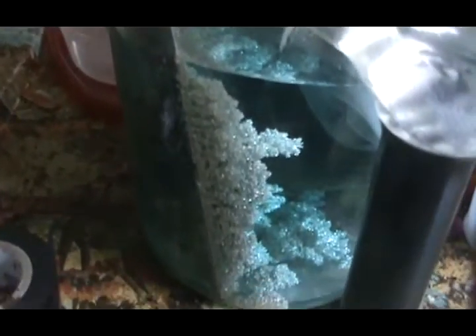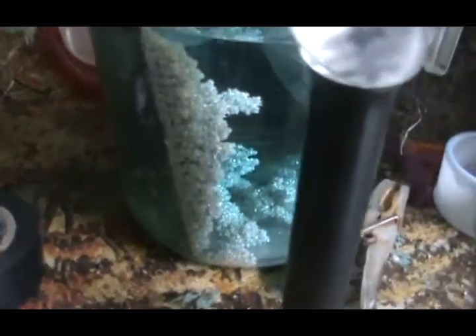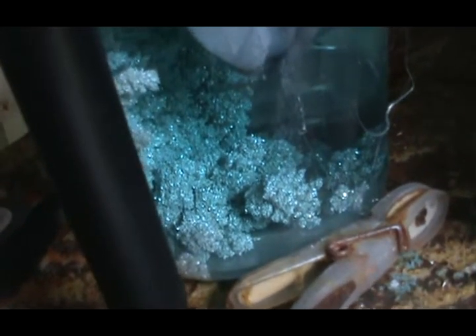That's a stainless steel sheet there. I like stainless better than graphite — works a lot better, I think anyway. Some people like graphite as the cathode, but I'll see you in a little bit.